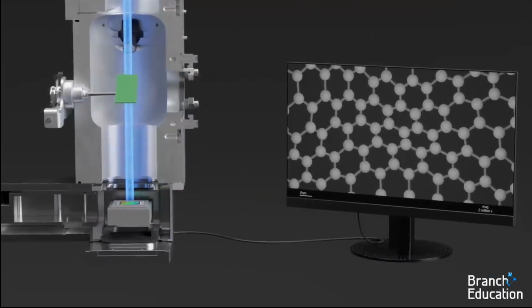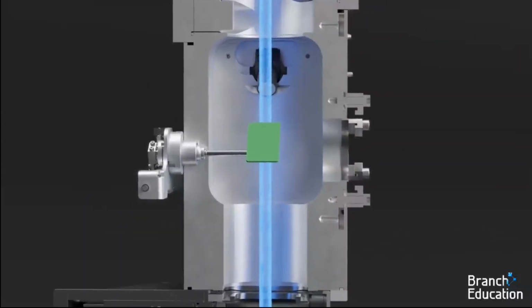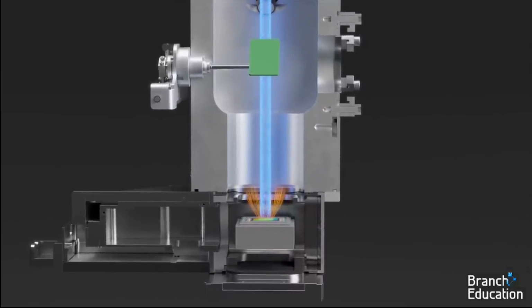The purpose of having two systems is that the phosphorescent screen and camera is used to ensure that the electron beam and magnetic lenses are set up properly, as an incorrectly focused beam could damage the sensitive CMOS camera.